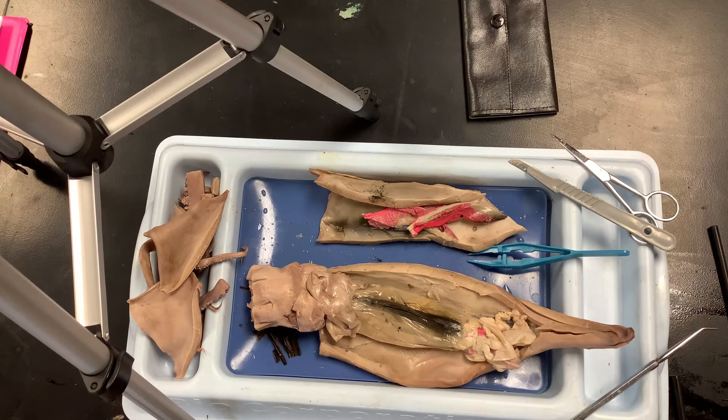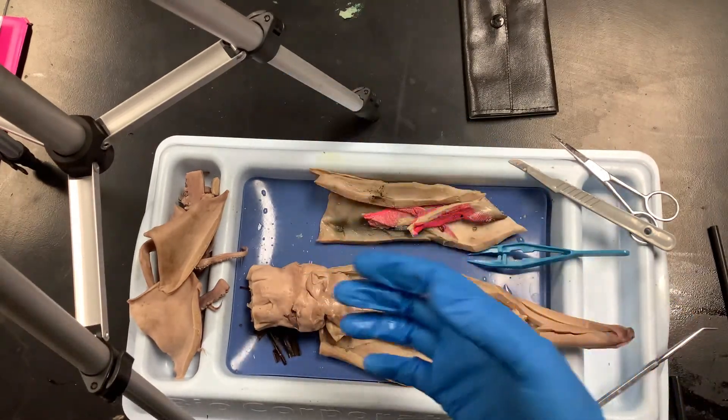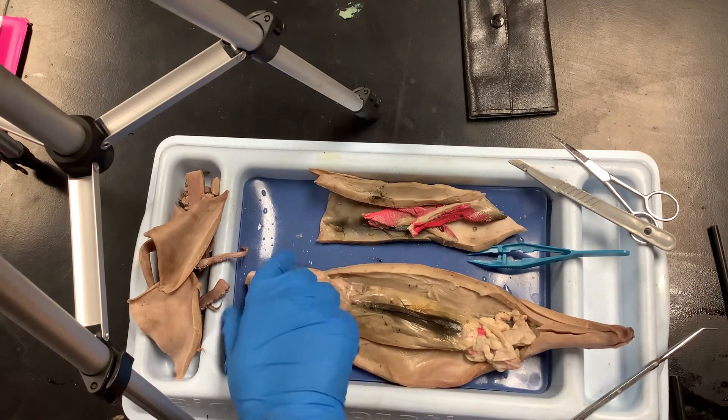That's an undigested meal — that's the stomach. Those are partially digested food particles, probably another type of squid or some kind of small fish. It's not at the poop stage yet — it's still undigested, still working its way through.